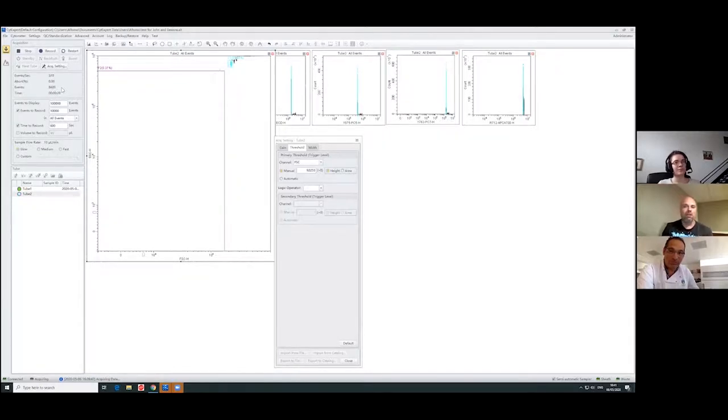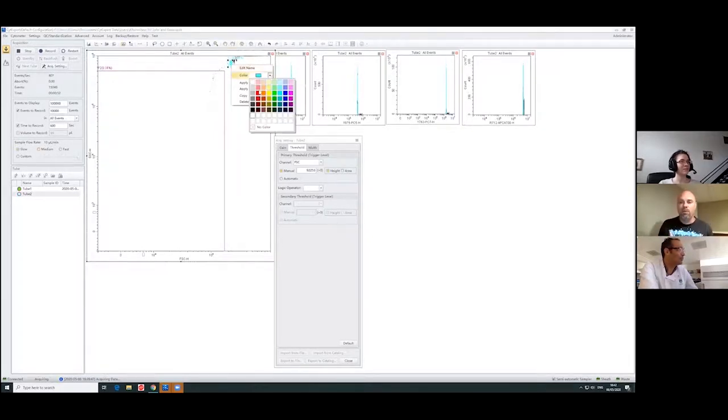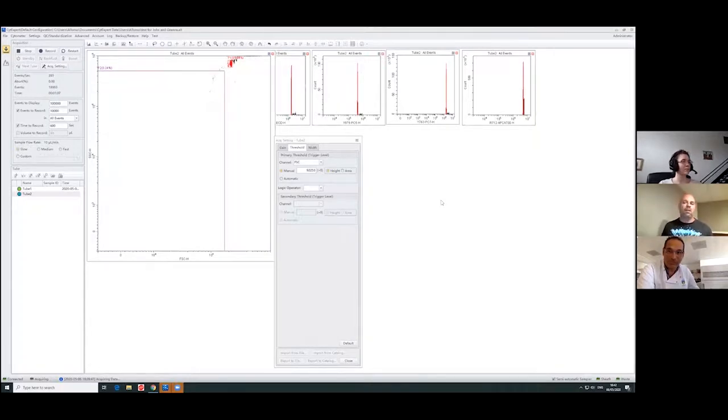Very simply, like you said, there's a physicist in the machine and he's doing all these algorithms very quickly. I think he's got a big chalkboard or maybe a whiteboard. The problem is he can't keep up. He can't do the equation and erase fast enough for the next thing. So as the events just come pouring through, you can't put them where they need to be. Instead of making a mistake, this physicist in the machine wants to be very accurate, so he just throws them out. It's easier to get rid of them than to make a mistake. He wants to be perfect. So that's a big thing to look into.